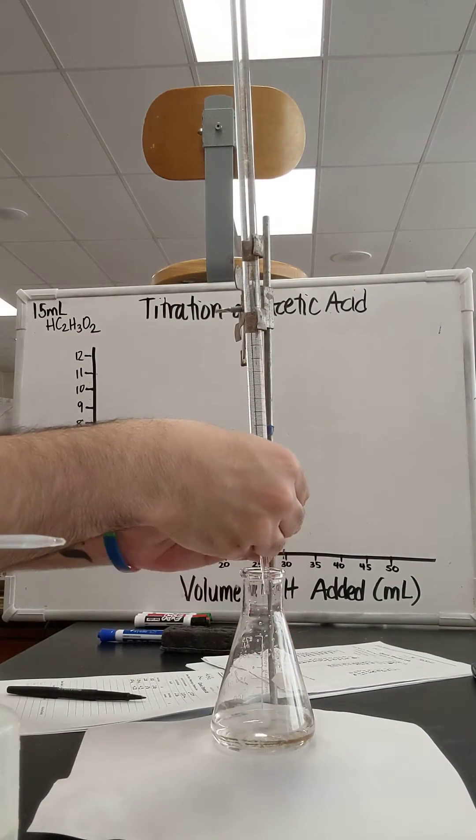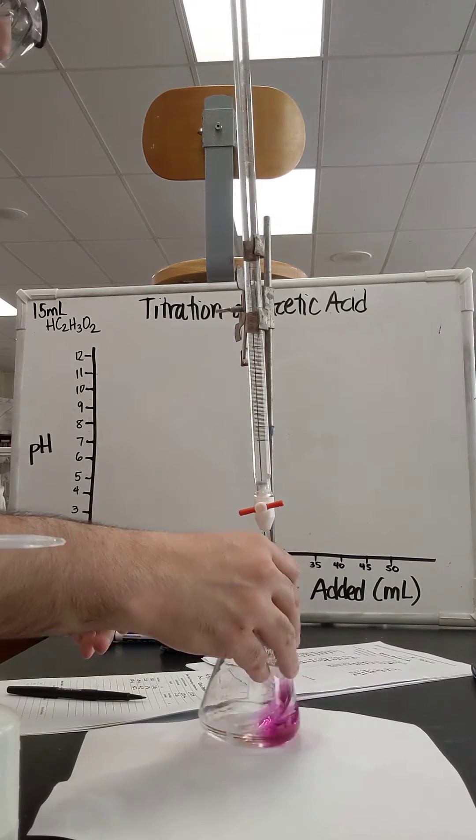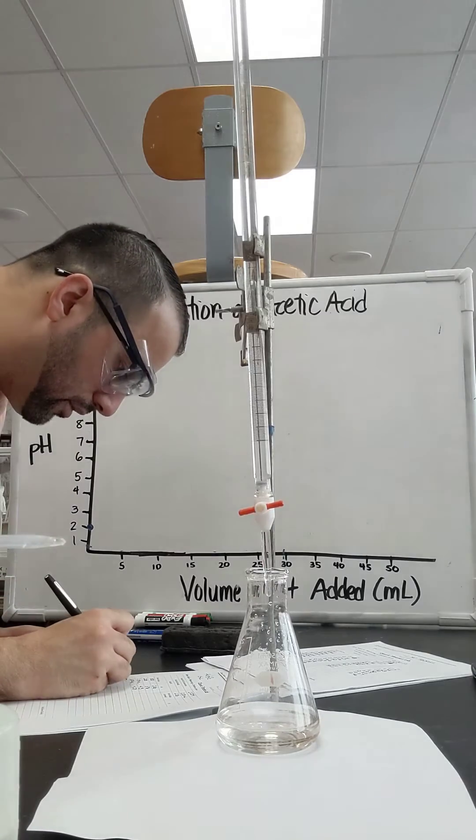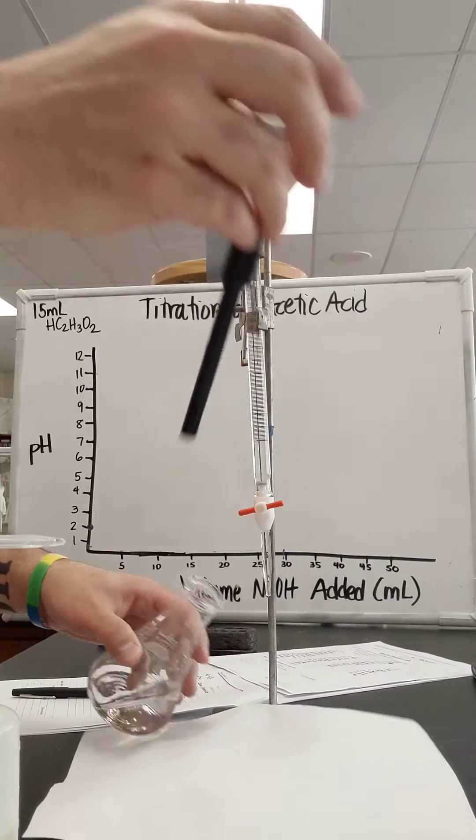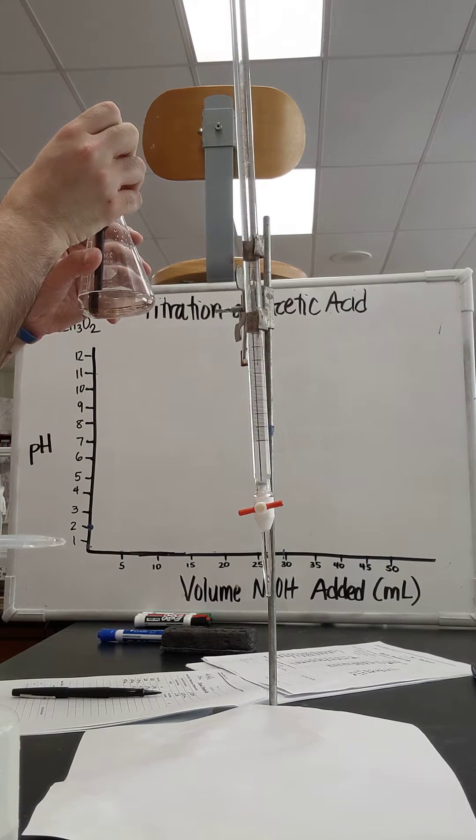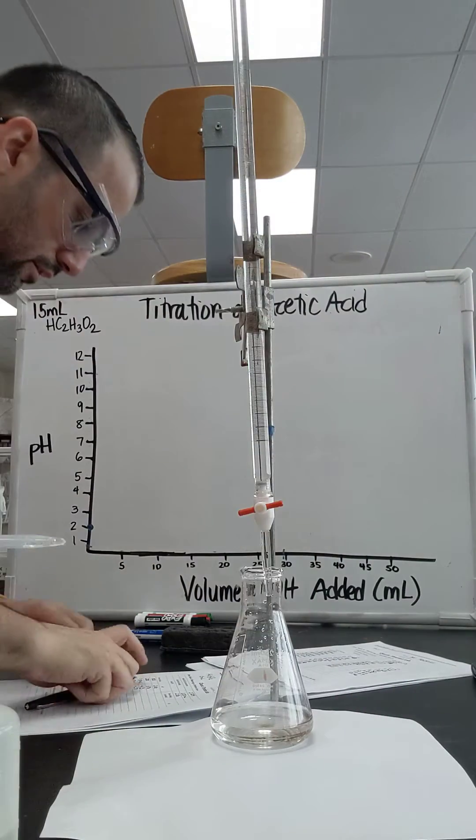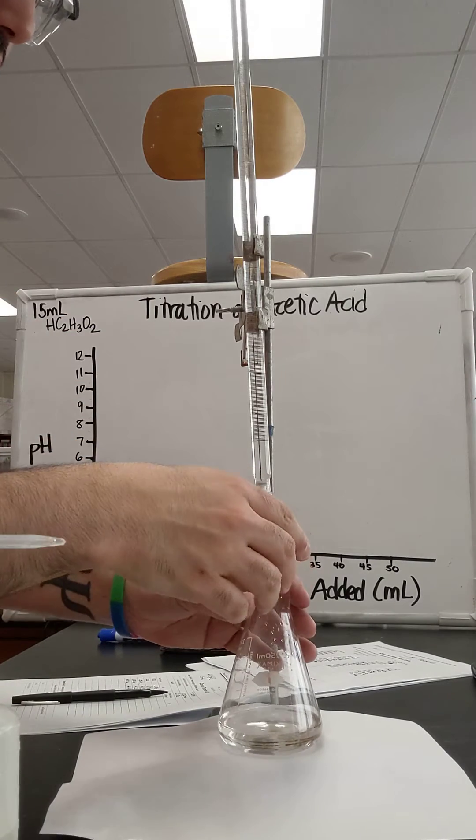Let's drop another 0.5. Actually, let's go to 4 milliliters. I got 4 milliliters in here. And it looks like my pH is 4.41. Kind of hanging on to a constant pH. There's a reason for that.